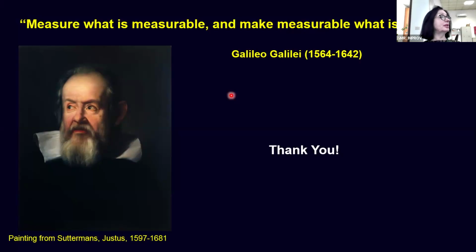And what is actually happening? I can reproduce, for instance, part of the curve using just a power law. I can also reproduce, very likely, part of the curve using a model for two-dimensional translational diffusion, because it also gives something similar to a power law, at least in a narrow range, and so on and so on. This is only one of very many examples. However, and this was an example which I analyzed recently, if I stick with the model of two-dimensional diffusion, at a certain moment I get diffusion coefficients which are nonsense. So somehow this is a kind of warning.